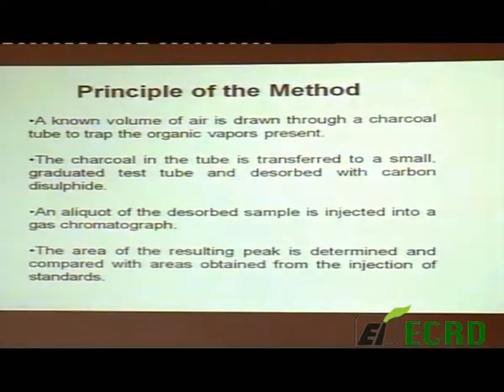Carbon disulfide is a hazardous chemical, so enough care is to be taken to avoid inhalation of the fumes. The work should be done in a fume hood. After desorption, a liquid portion of the dissolved sample is injected into the gas chromatograph. The area resulting from the peak is determined and compared with that obtained from the injection of the standards.